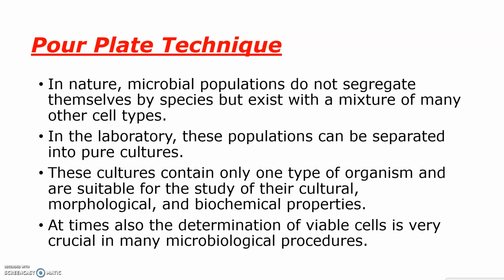They are suitable for our cultural study, morphological study, as well as to study the biochemical properties of each of the microorganisms. At times, it also helps in determination of viable cells, which is very crucial in many microbiological procedures. In microbiological investigations, there is a necessity to check whether the organism is viable or not. For all these studies, we require the organism to be in a separate pure culture.